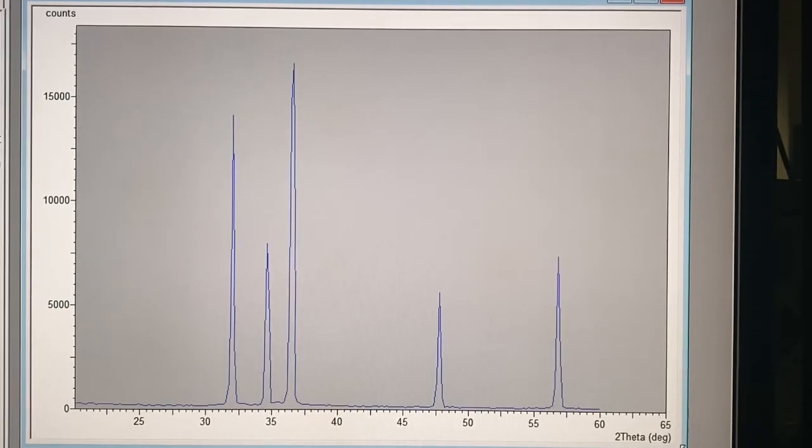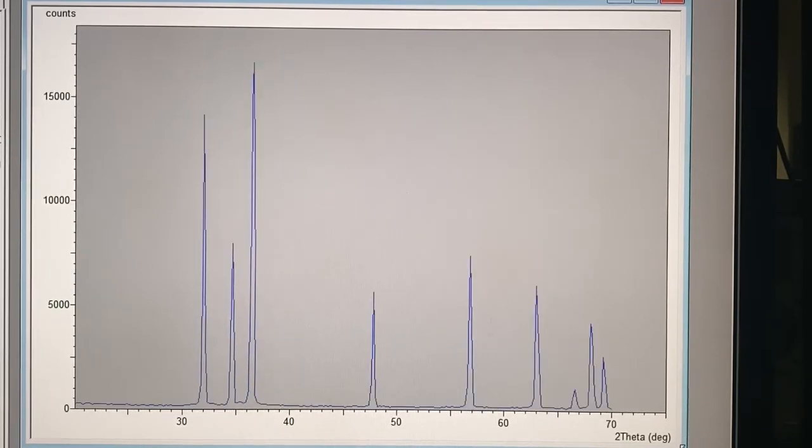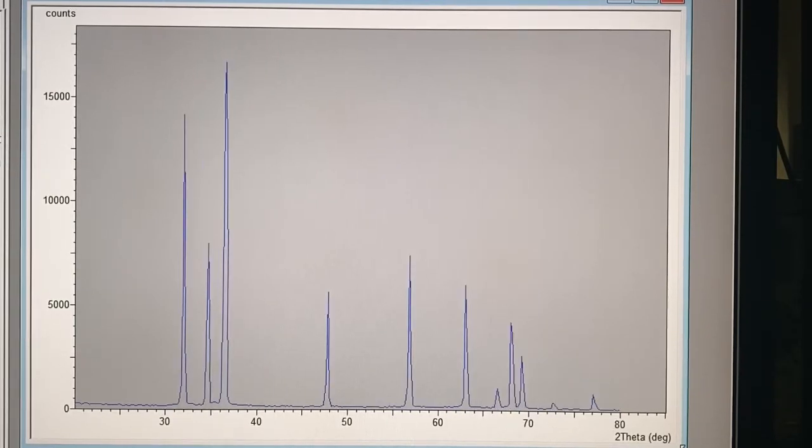Since the relationship in Bragg's law is between the wavelength lambda, the d-spacings of the crystal, and the value of the diffraction angle theta, we can use the measurement of the values of 2 theta to extract theta. Since the wavelength is known, lambda of K alpha for copper, then we can solve Bragg's equation for the d-spacing associated with each peak position.